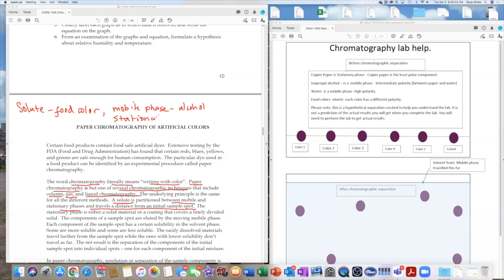Stationary phase, okay? So to kind of go off script, to give you the bottom line. Oops, sorry, what am I writing? This is what happens when I'm trying to talk and write at the same time. This is going to be your paper right here. Back to writing. Paper. So you copy your paper, okay?